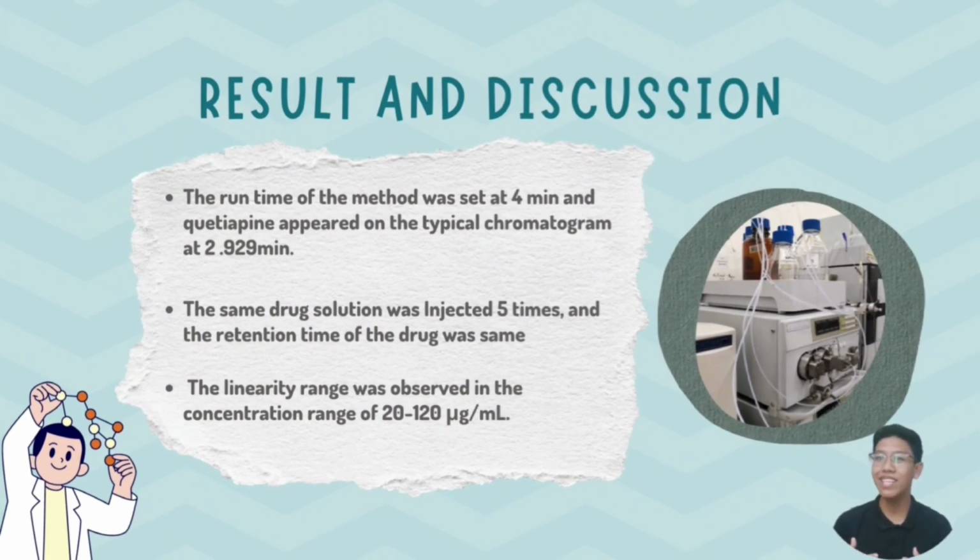By applying the method, the run time was set at 4 minutes and quetiapine appeared on the typical chromatogram at 2.929 minutes, which indicates a good baseline. Next, when the same drug solution was injected 5 times, the retention time of the drug was the same. The linearity range was observed in the concentration range of 20 to 120 microgram per milliliter.